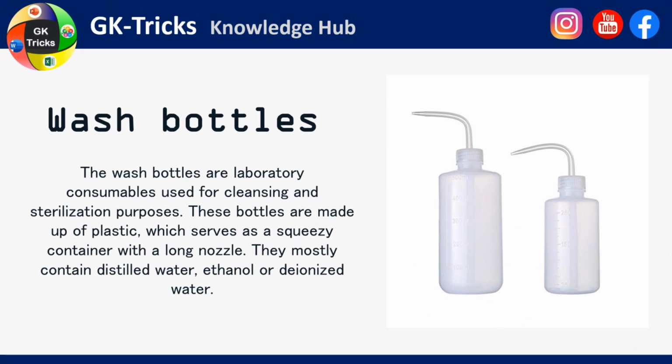Wash bottles. The wash bottles are laboratory consumables used for cleansing and sterilization purposes. These bottles are made up of plastic, which serves as a squeezy container with a long nozzle. They mostly contain distilled water, ethanol, or deionized water.